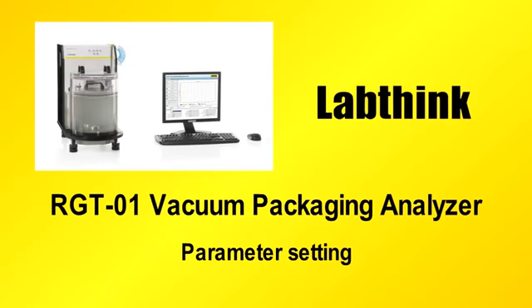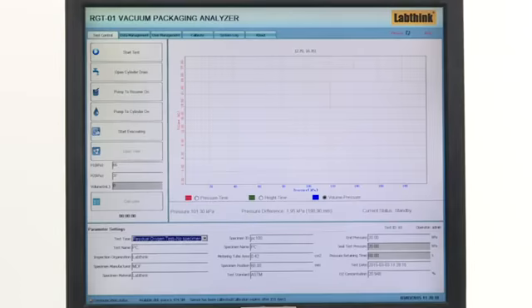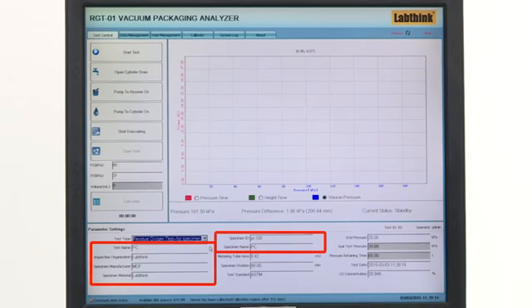Parameter setting. Click Test Control in the toolbar in the main interface and enter the Test Control interface. Select Residual Oxygen Test, no specimen as the test type. Input test name, inspection organization, specimen name, specimen ID, etc., which are going to be stated in the test report.